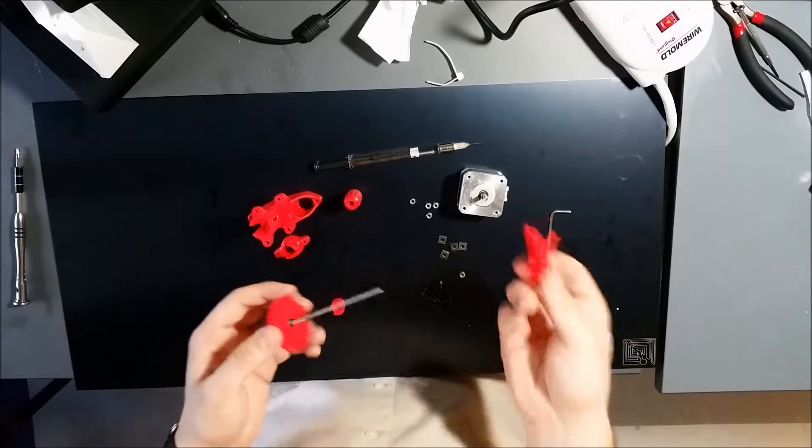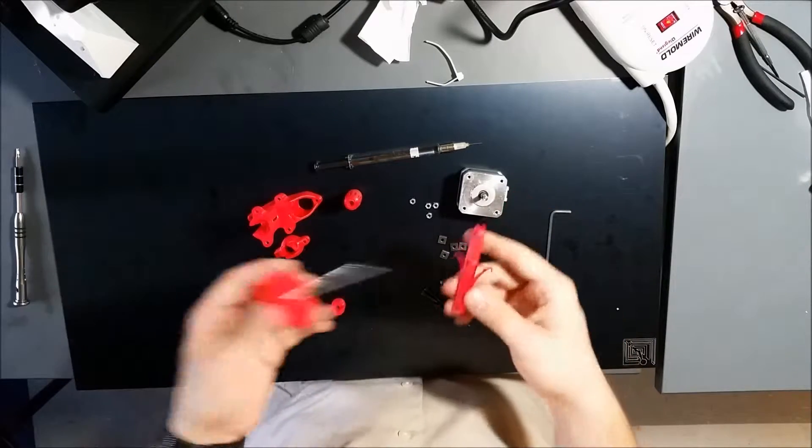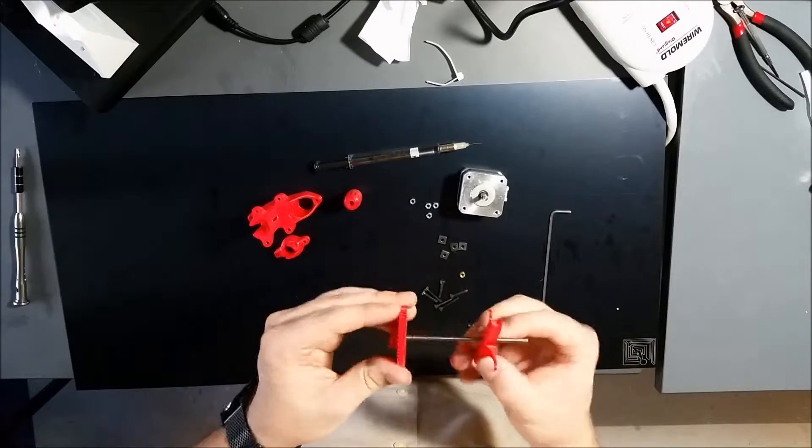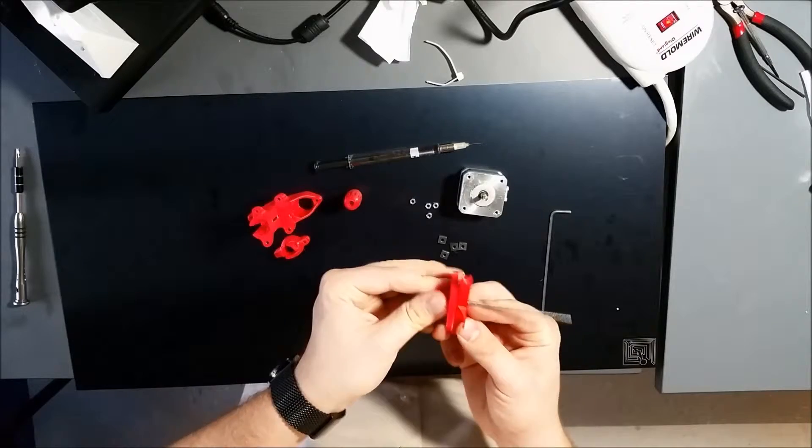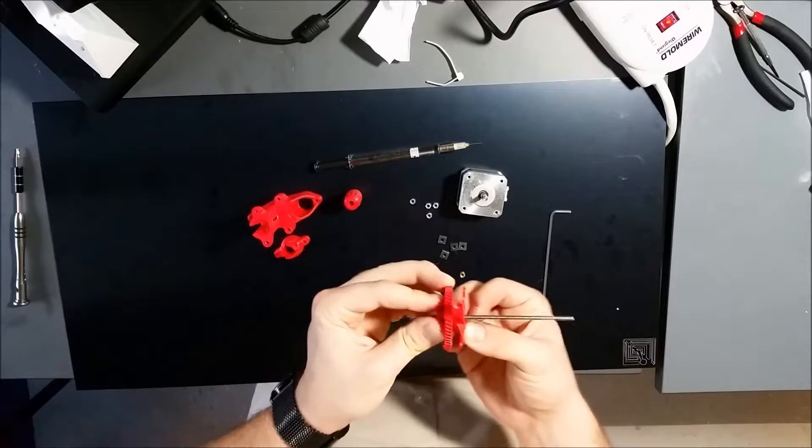And then from there you're going to take the rubber band tensioner, which goes on the top of the repostruder, and slide it down so it's in this orientation. It looks weird but it ends up working later on and you'll see.